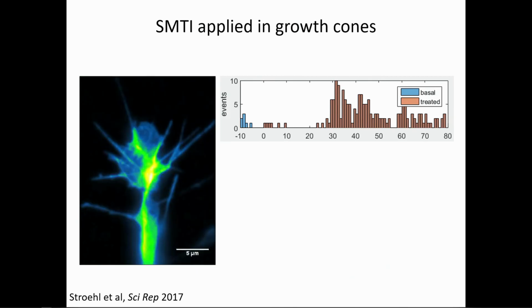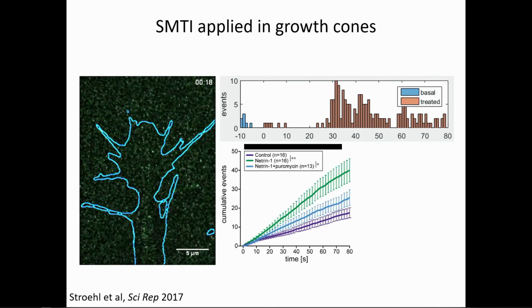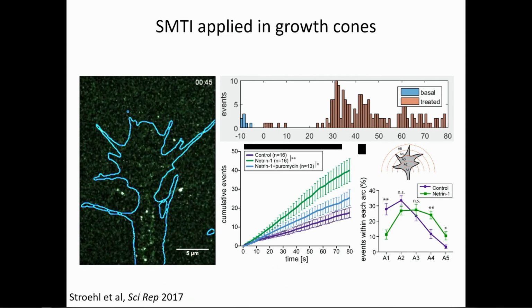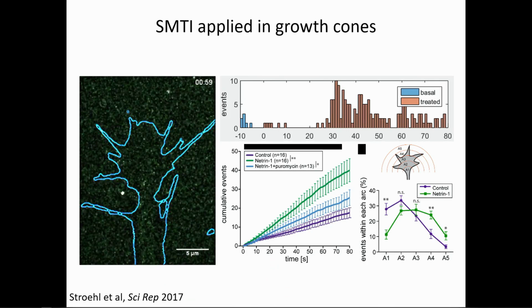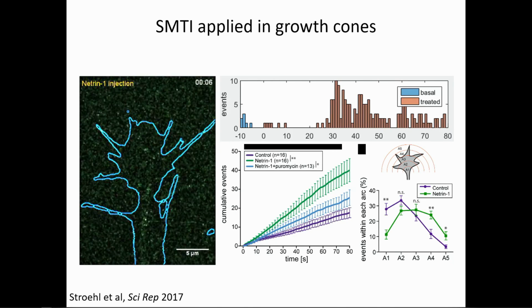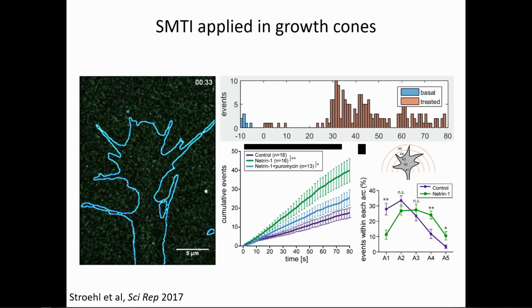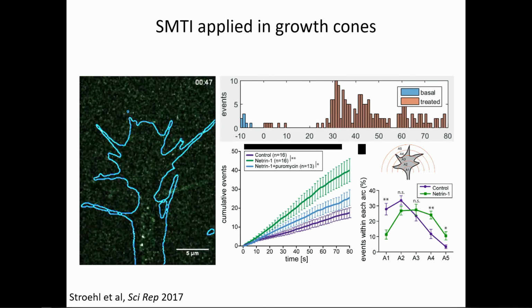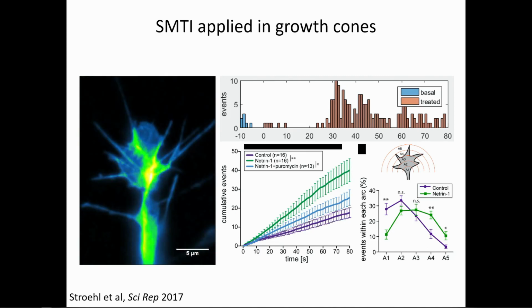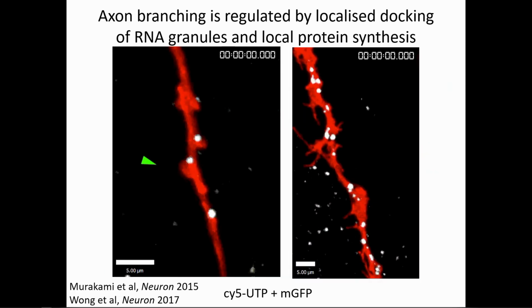So these are powerful research tools that are enabled through this trick of single molecule localization microscopy. So if you want more details, you can read about these in papers that are shown here. But for the purpose of this course, it's just giving you examples. So you can do single molecule localization, but you need low densities of fluorophores. And in some cases, this condition is given also in live cells, in which case this technique is called single particle tracking, because the particles will move, but it applies nevertheless, and you get super resolution about these events.